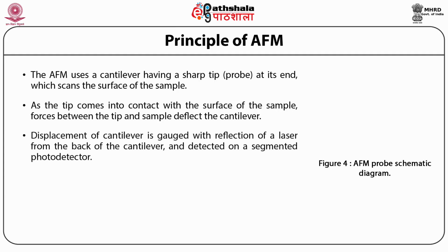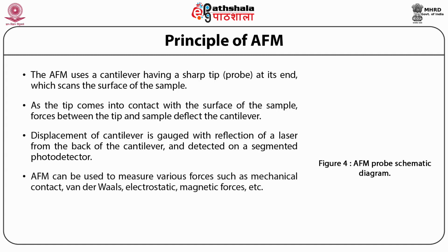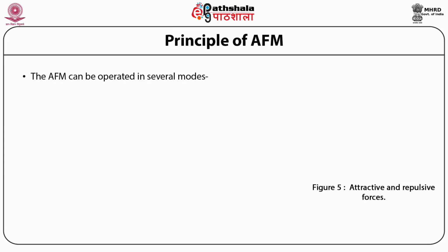Displacement of the cantilever is gauged with reflection of a laser from the back of the cantilever and detected on a segmented photodetector. AFM can be used to measure various forces such as mechanical contact, van der Waals, electrostatic, magnetic forces, etc.